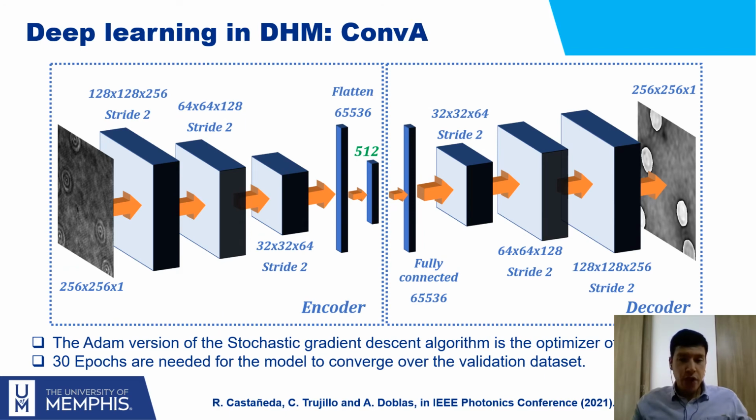The structure of the trained convolutional autoencoder can be seen in this slide. As we can see, the encoder is composed of 3 convolutional stages. In each one, there is a convolutional layer and, of course, a max-pooling layer. 3 stages of these types of layers for the encoder, and, with the same parameters but in an opposite way, we implemented the decoder part.